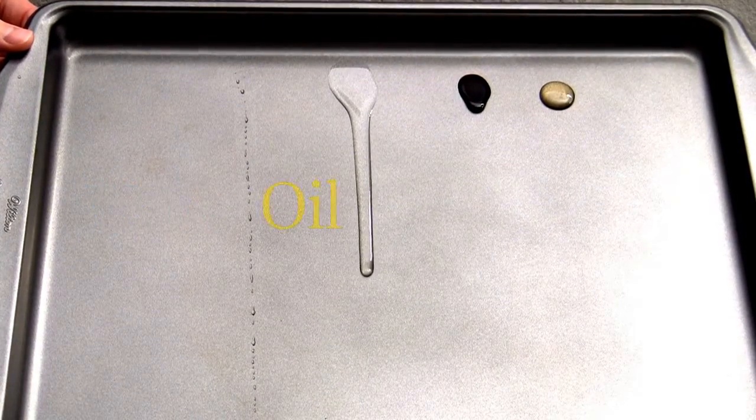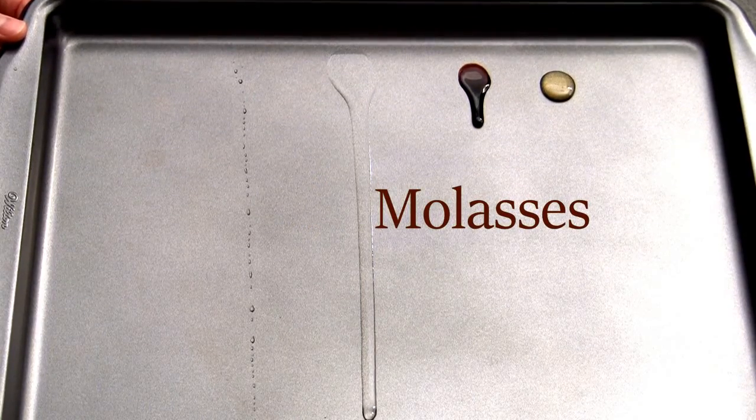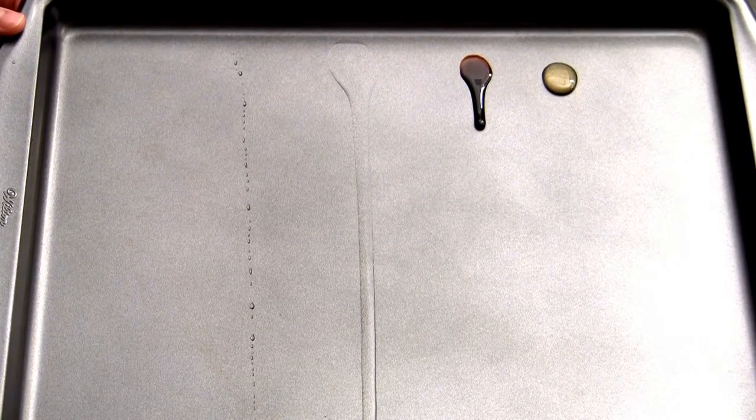Viscosity is the degree of a material's resistance to flow. Low viscous materials flow quickly like water, and highly viscous materials flow slowly like honey.